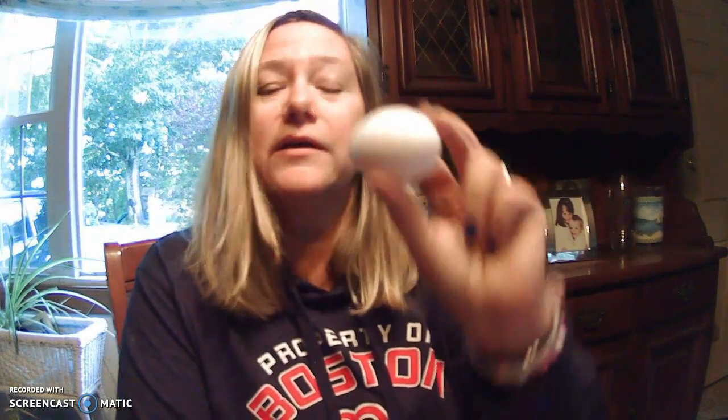So we're going to start the lab. I'm going to show you a few things. You're going to write down your observations. You're going to write down some measurements, and then you're going to see what's happening over a few days. I'll have different recordings showing you what's happening to our little egg baby.